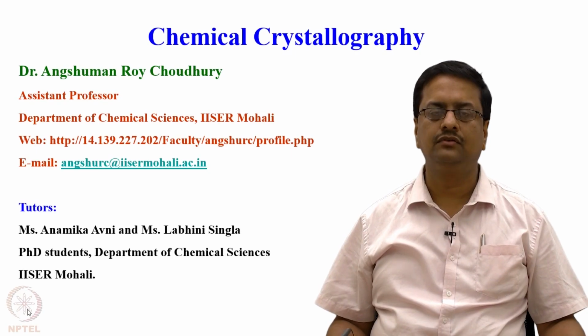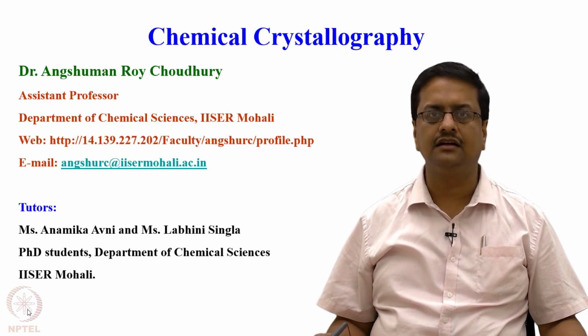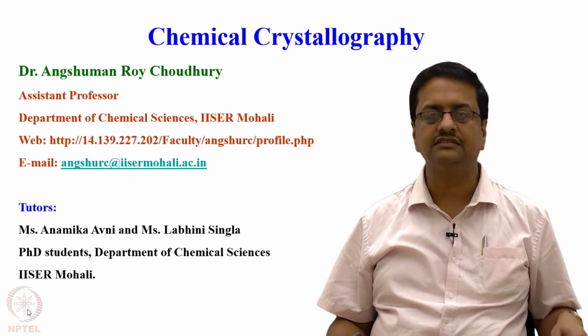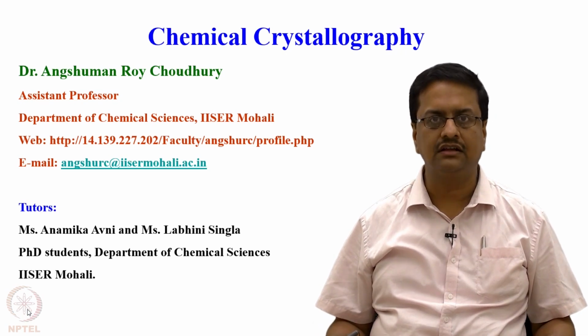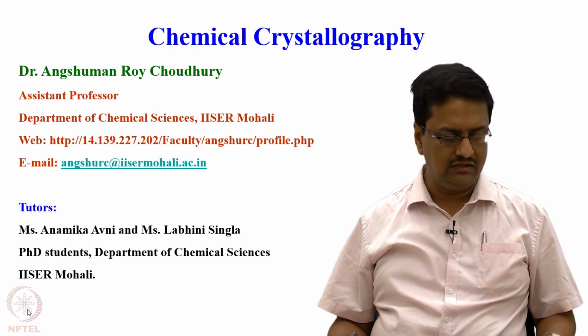Welcome back to the course of chemical crystallography. In the previous lectures, we have learned how the structure solution programs work, and we discussed the different methods of structure solution, like how the direct method works and how the Patterson method works. So today we will start with structure refinement.